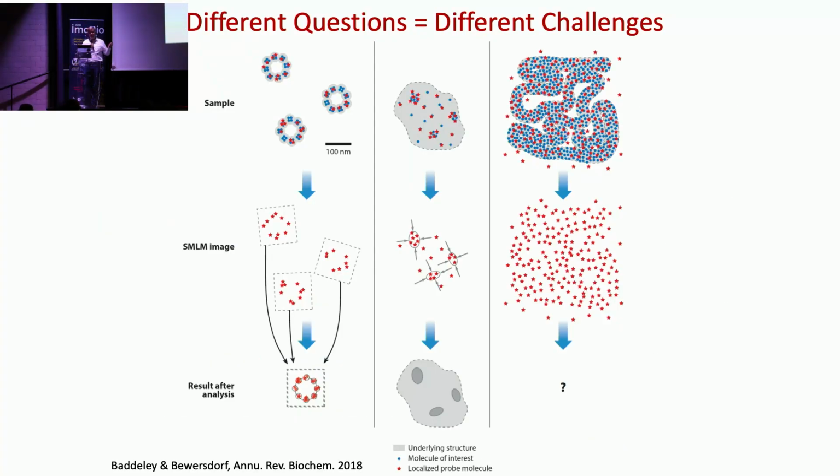This slide is more of a philosophical argument, right? You need to keep in mind when you use these super resolution techniques what the question is I want to answer, and depending on the question, you'll have very different challenges. So I showed you the nuclear pore complexes at the beginning as a kind of simulation, or to motivate this. And this is essentially one of the easiest examples.